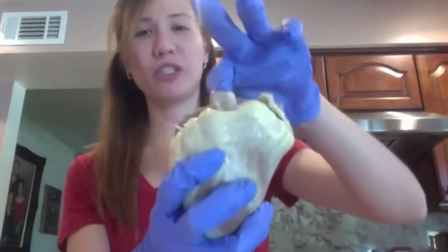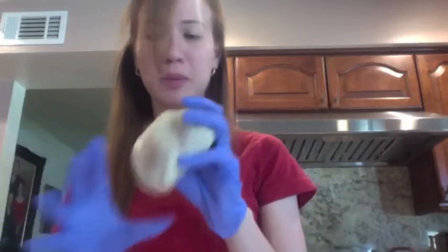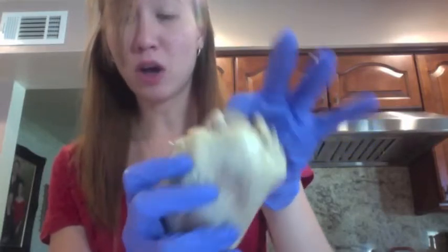So now we have our pulmonary trunk, which is right here where my finger is. The pulmonary trunk carries the blood from the heart to the lungs, and it is deoxygenated blood. We have our aorta back here, and the aorta carries the blood from the heart to the body, and it carries oxygenated blood.